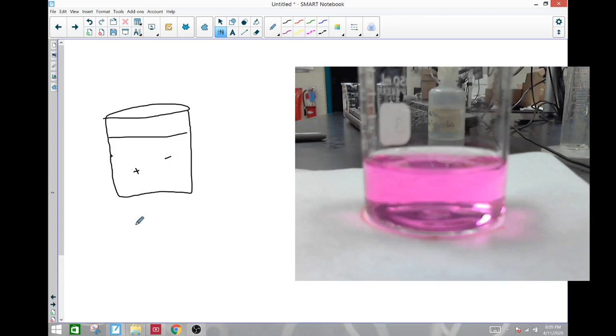There's a bunch of them, and the cation is H plus ions. I don't know how many I have, but I'm dropping in hydroxides in here, and for every hydroxide I drop in, my solution starts acidic, and is reaching upwards pH towards 7, and it will go towards the basic range if I let it.